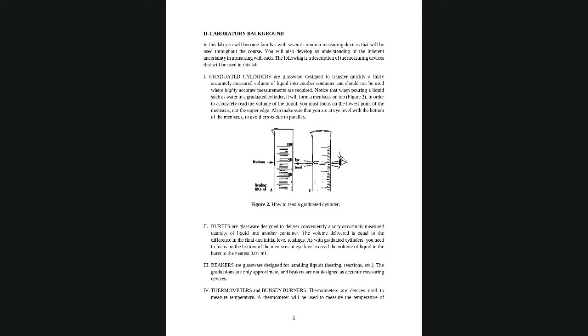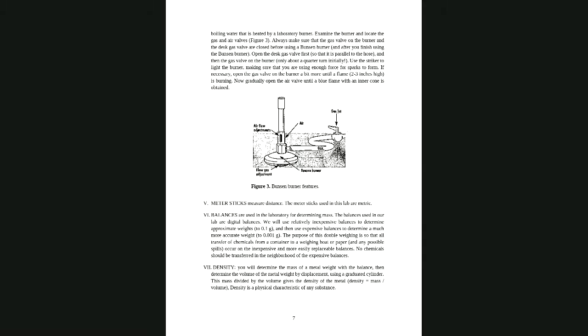Beakers are equipment designed to transfer liquid from a larger container to a smaller one, or for mixing a reaction mixture. They are not the best or most accurate devices for measuring. A thermometer is going to measure the temperature, of course. A meter stick would measure the length.